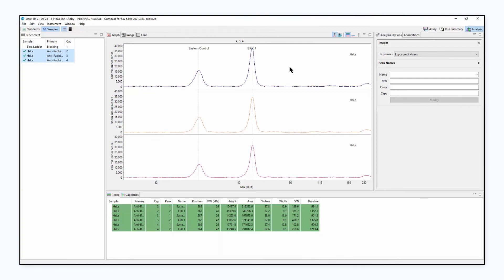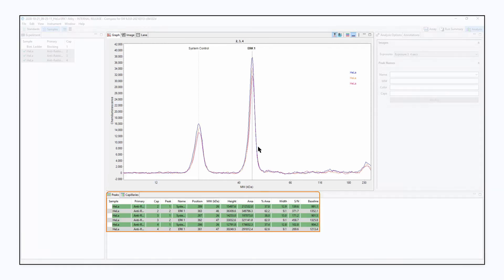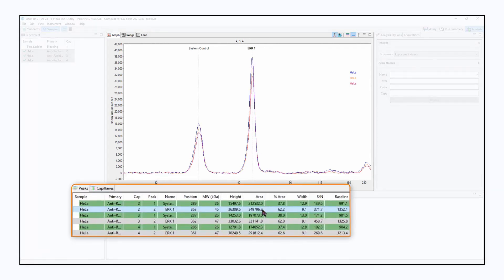Even better, she'll quantitate the data for you too. With a few clicks, you'll be analyzing immunoassay-like standard curves and precisely quantifying your protein.